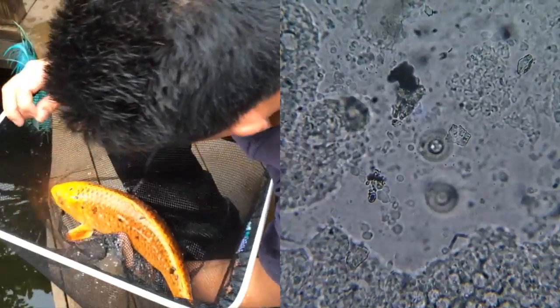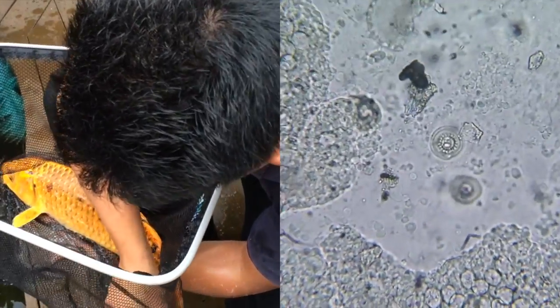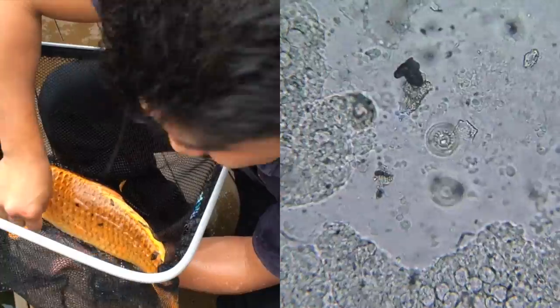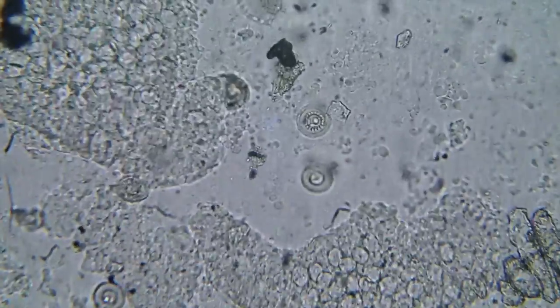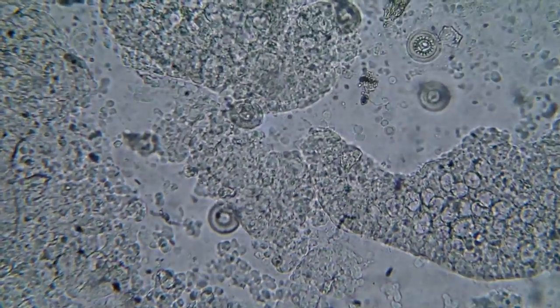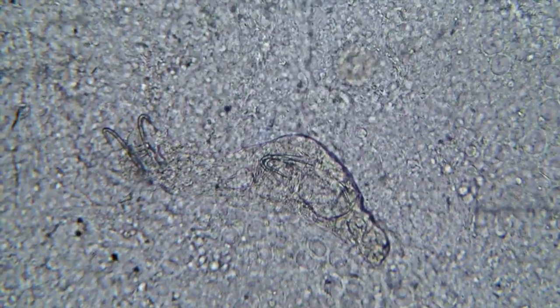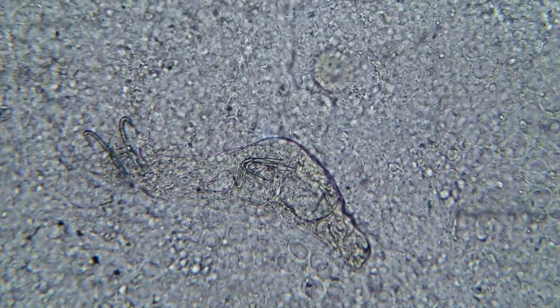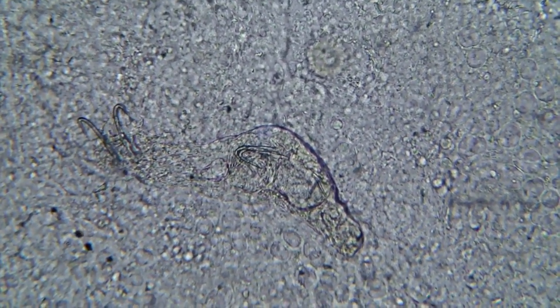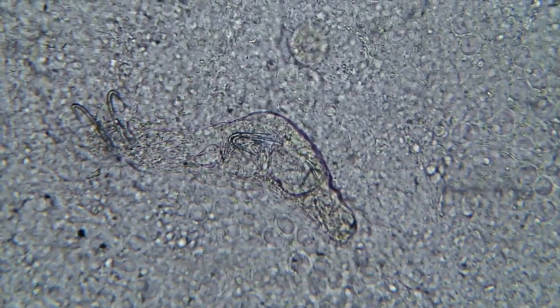Next we're looking at Trichodina — these are ciliated protozoa organisms. They're not primary pathogens, but in numbers such as this, seen here on a skin scrape from a koi, they can cause severe irritation. This is viewed at 100x magnification. This large organism here is a skin fluke — you can see the huge haptors, the anchors or hooks. In the center you can see more hooks belonging to the embryo inside this worm. This is a skin fluke known as Gyrodactylus, and it is a primary pathogen that is very bad for your fish.